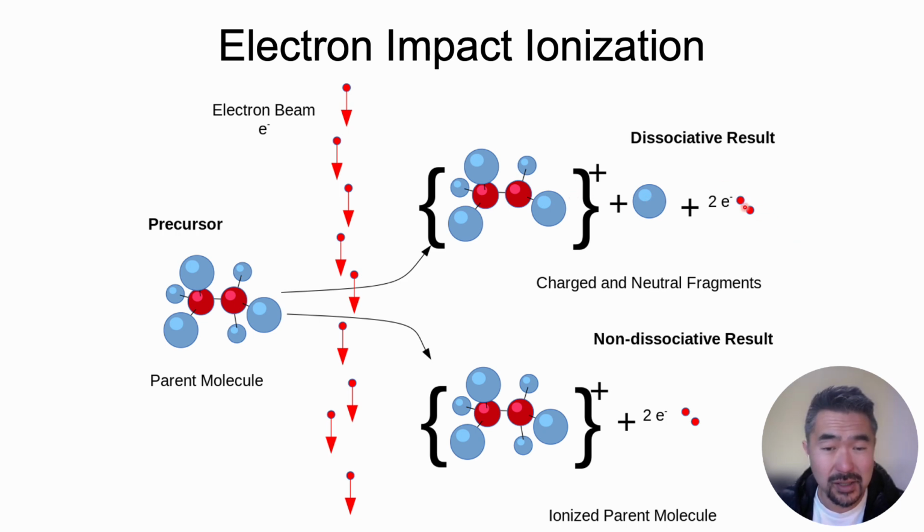So one of these two electrons came from the parent molecule, and one came from the electron beam. Sometimes, though, all that happens is it just knocks out one of the electrons in the parent molecule, whether it's in a lone pair or one of the bonds. So it results in a very unstable cation. Sometimes a bond that's supposed to be made of two electrons is now made of only one electron, and so forth. And as you can imagine, these cations are really unstable.